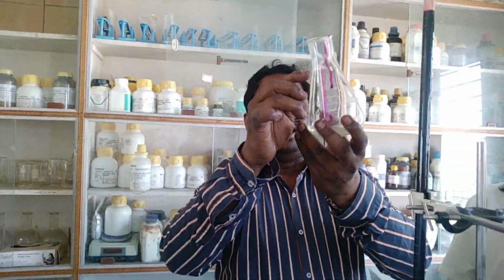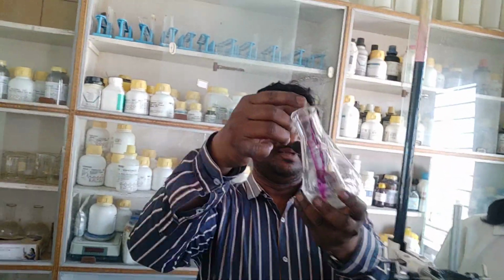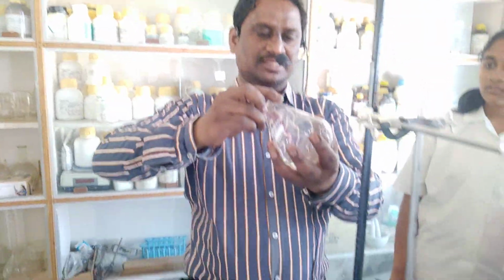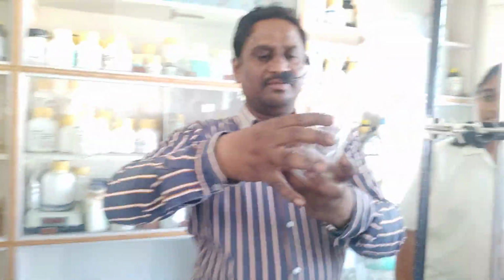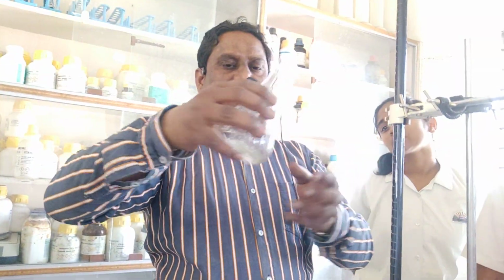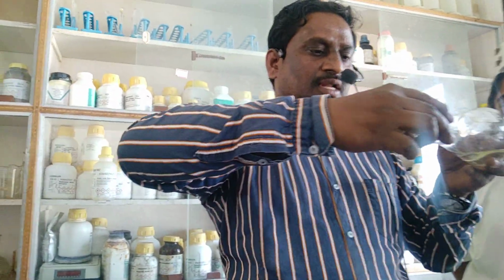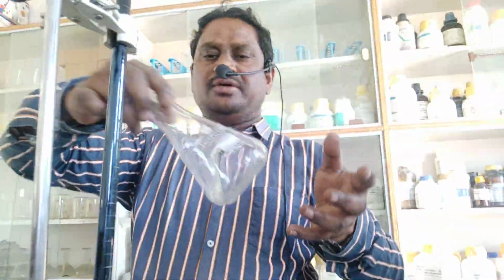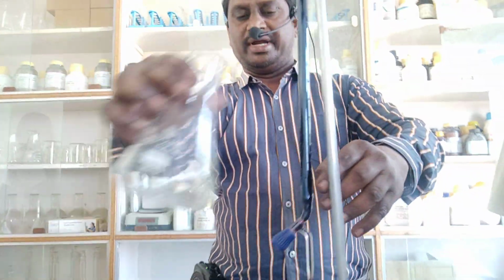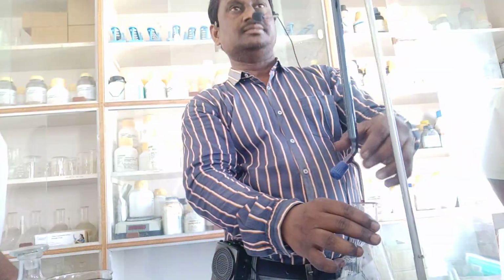Suppose this falls on the walls of the conical flask, just make it shake like this and completely dissolve it. Suppose unfortunately it falls on the walls of the conical flask, just make it dissolve completely. Slowly you have to make it dissolve. Now look at here, all of you. Look at here carefully.